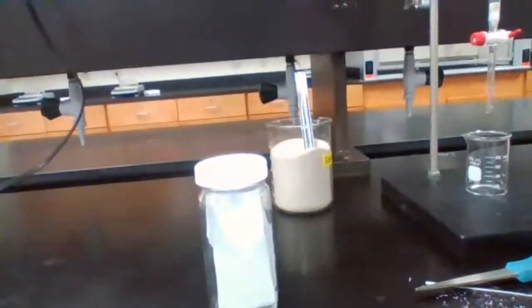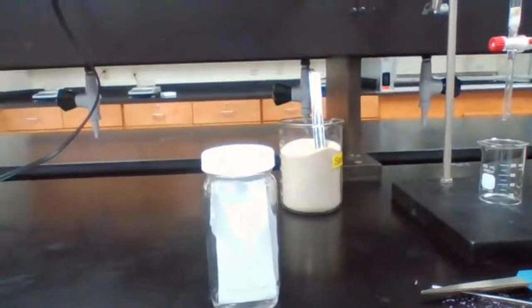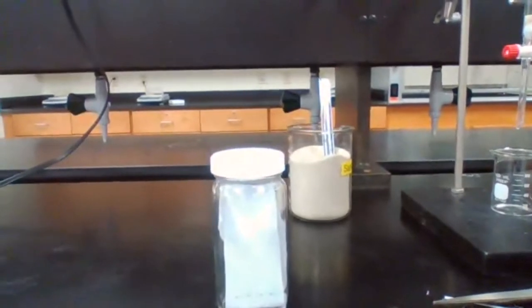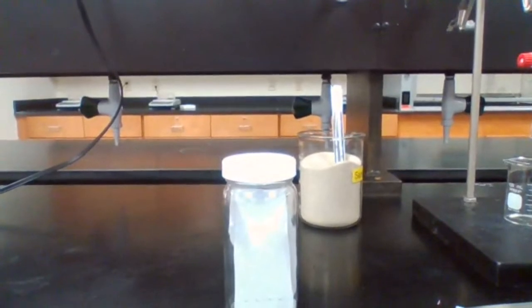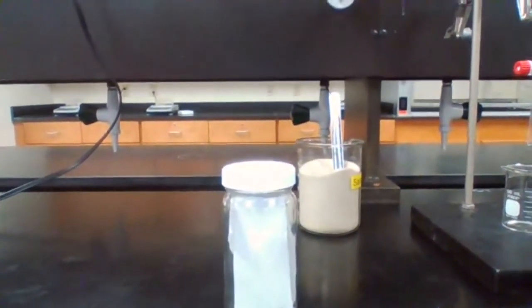I'm going to bring the camera close so at least you could see the shade that is different, where the wet paper is versus the wet plate versus the dry part on top. And then I will stop it when it reaches half an inch from the top of the plate.